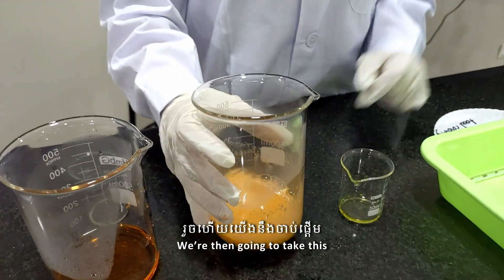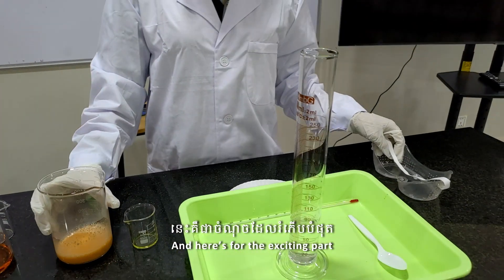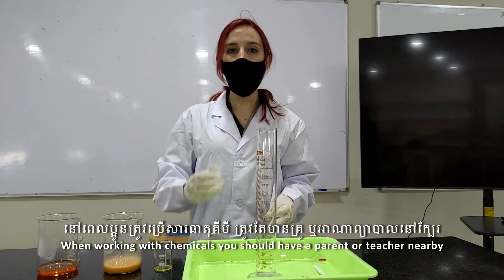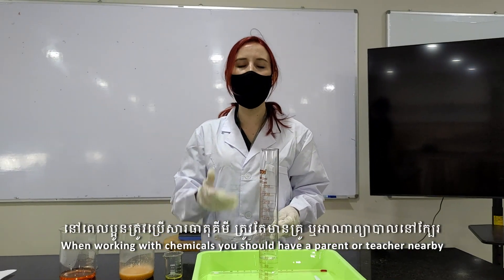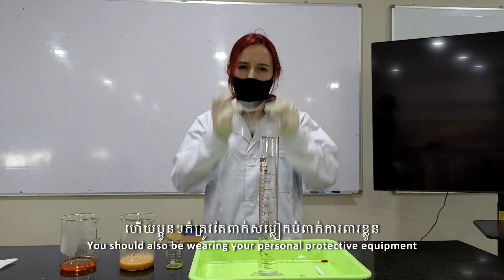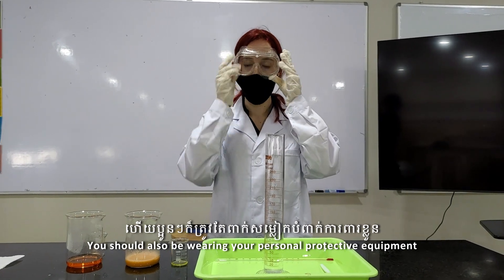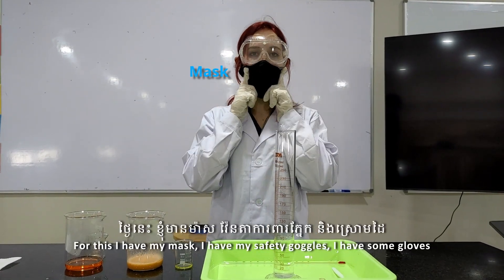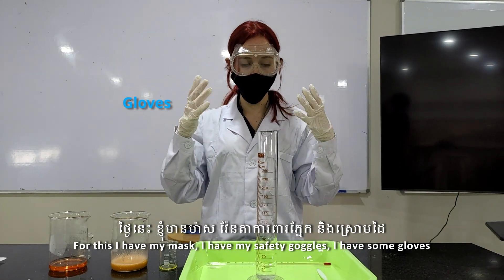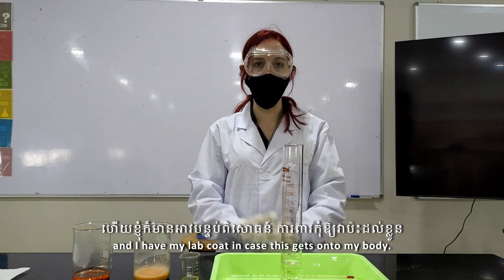We're then going to take this and test the experiment. Now remember, in a science class you need to be safe. When working with chemicals you should have a parent or a teacher nearby. You should also be wearing your personal protective equipment — for this I have a mask, safety goggles, gloves, and a lab coat in case this gets onto my body.